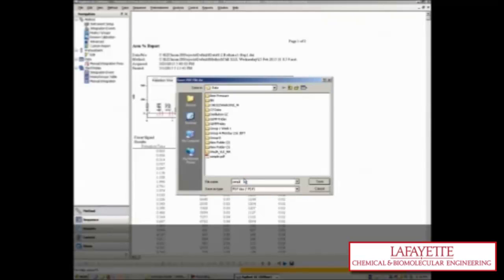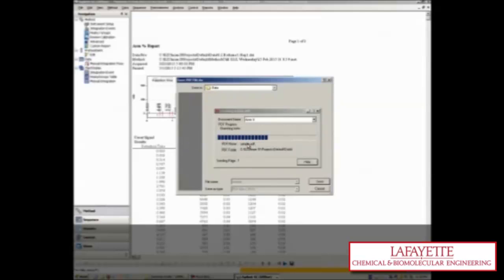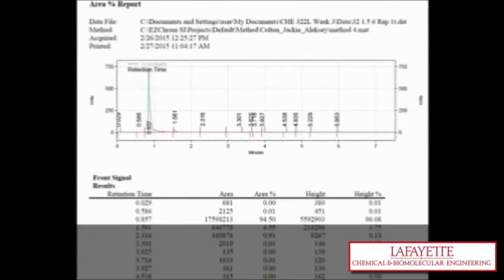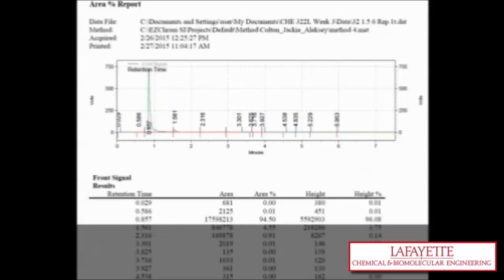Each peak in the analysis will have its own retention time. In the case of methanol water solutions with an isopropanol internal standard, the first peak will be methanol due to its lower boiling point. Peak areas for both the analyte, methanol, and the internal standard should be recorded along with their respective retention times for all chromatograms obtained.